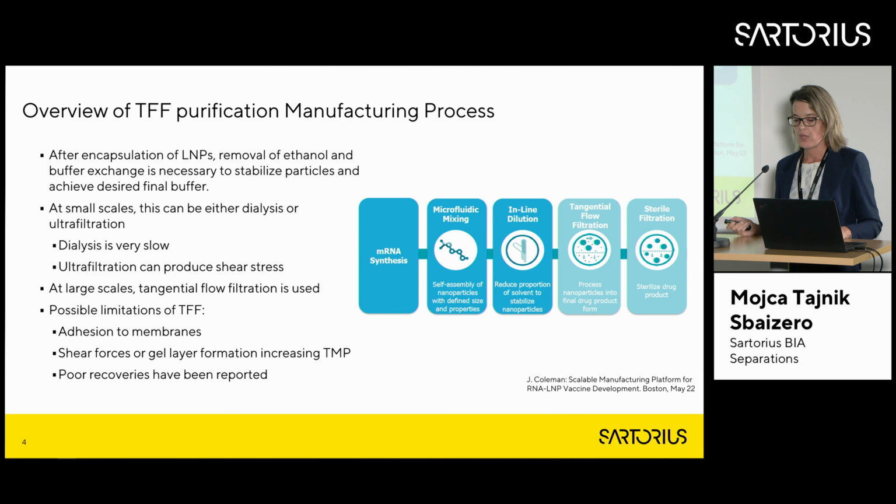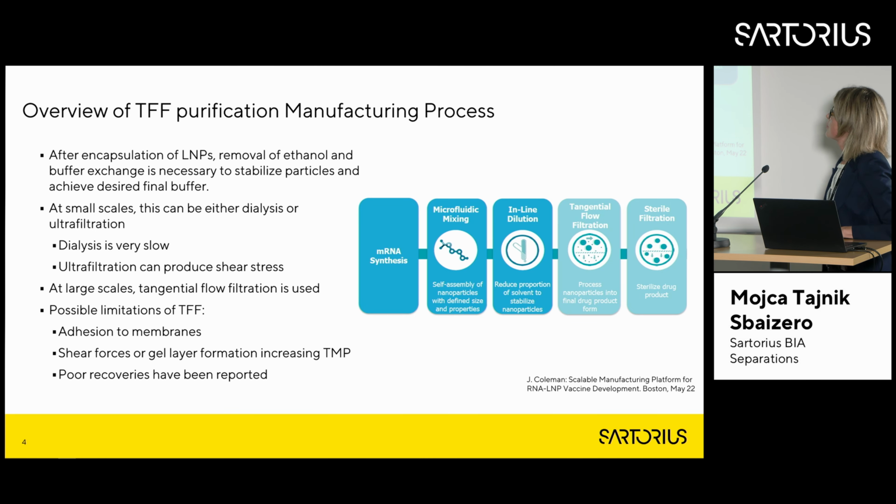So this is a relatively simple process, but simple is not always good. With this process, we remove mainly the ethanol, and we buffer exchange the sample to the real buffer that is then used in the drug product, and concentrate.